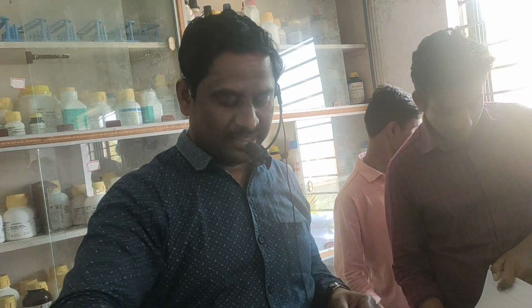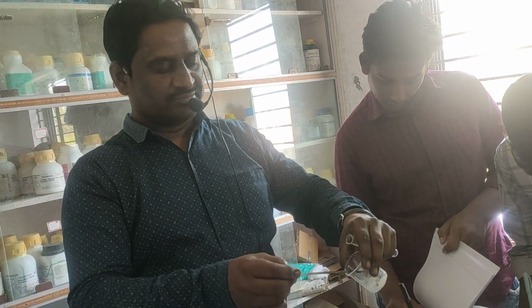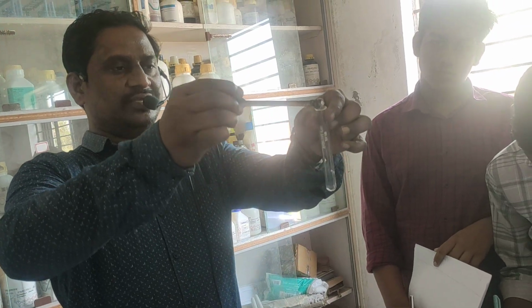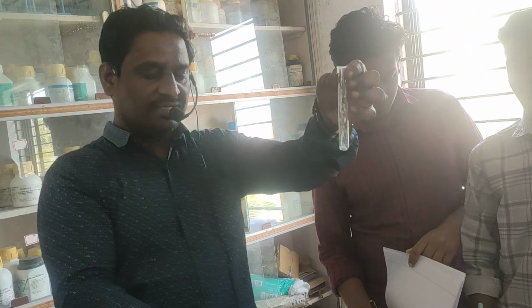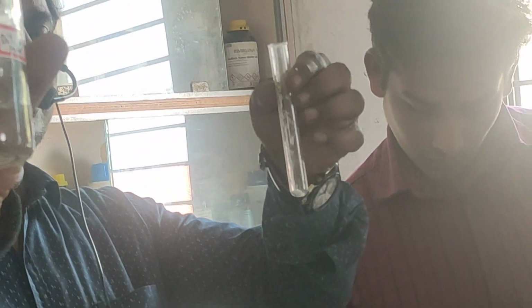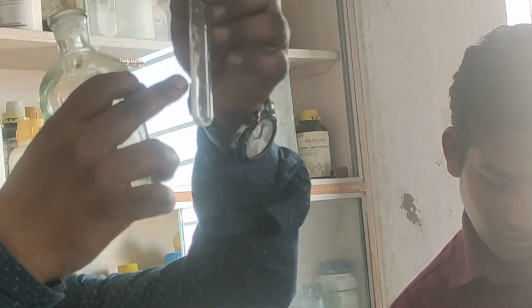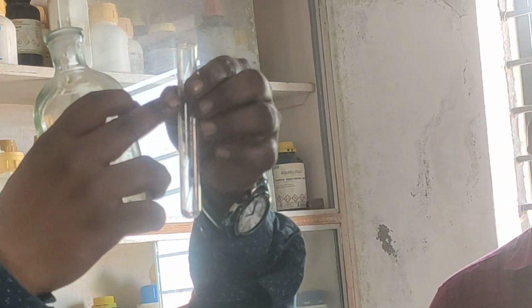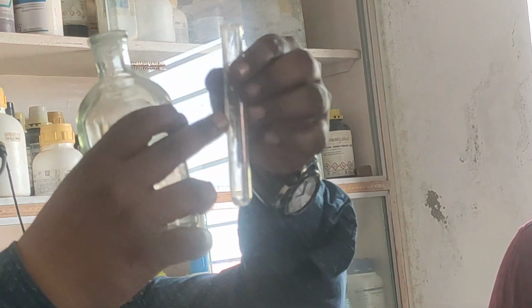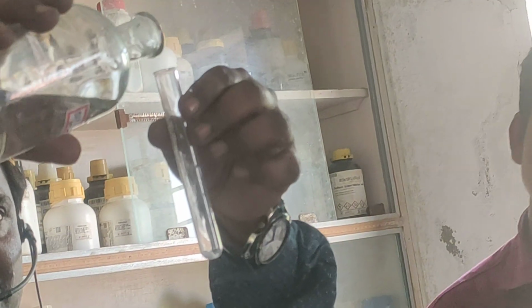Now I am taking a test tube. Observe carefully, all of you. Don't take more salt, just a little bit. For the given salt, what should we add? Dilute HCl. If you add dilute HCl, colorless gas is evolved. You can't see the color because the gas comes out very fast. That colorless gas means carbonate may be present.